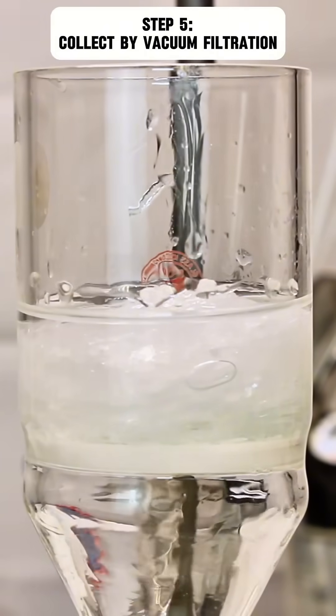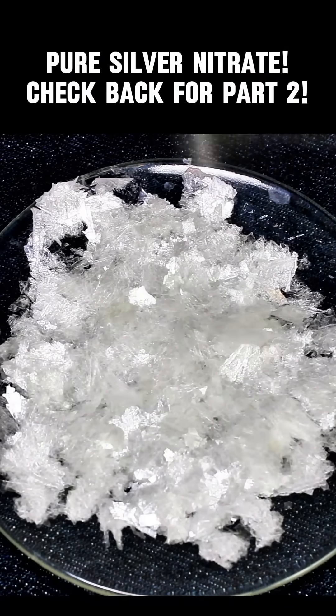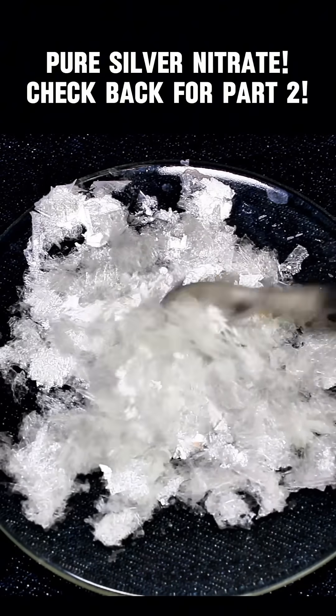They can then be stored in pretty much any non-metal container for any amount of time until you're ready to use them. As a final word of warning, just make sure silver nitrate never comes in contact with alcohol, or it'll form the incredibly dangerous silver fulminate. Silver fulminate can be decomposed by hydrochloric acid into cyanide, but that's not really much safer.